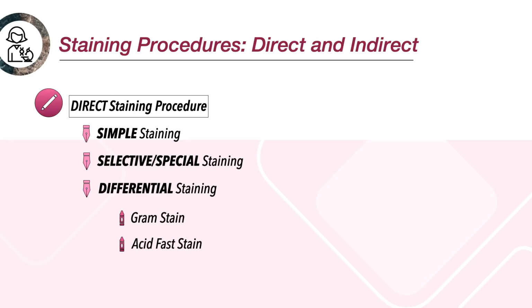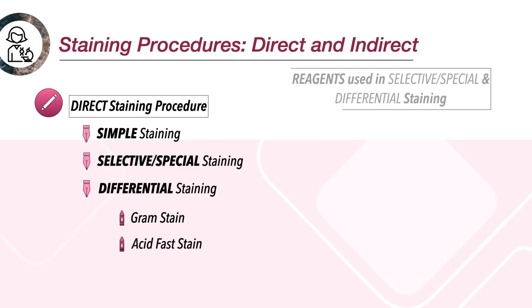Okay, for your selective and special staining or differential staining, guys, no, diba I told you these are much more complex compared to simple staining wherein isa lang talaga yung stain na gagamitin natin. That's why it's important din for us to know kung ano yung mga different reagents na makikita dito. Okay, disclaimer, just a really important note. Okay, the reagents here that are used in the selective and differential staining, ito yung format.